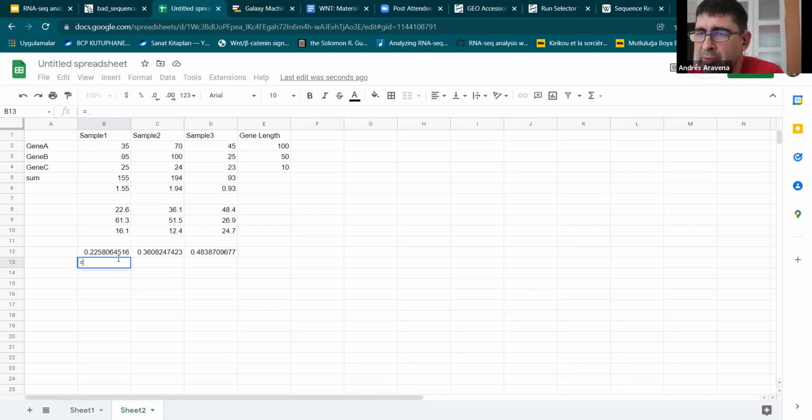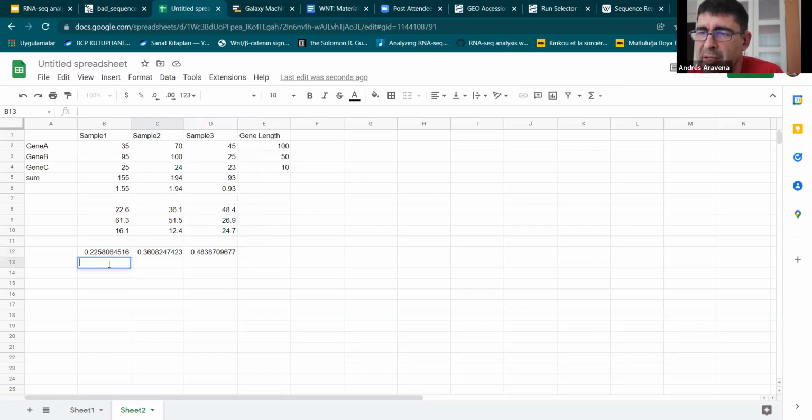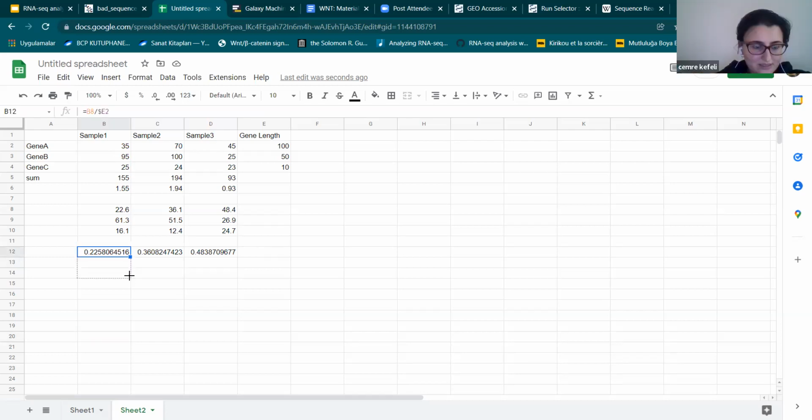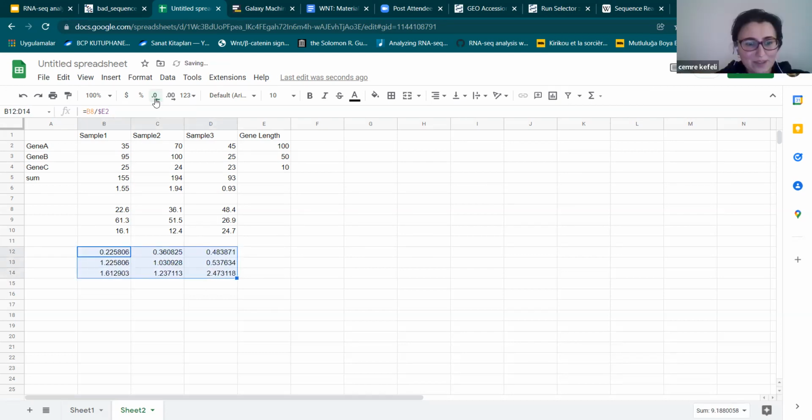I think you can copy. Going like this, you mean? Yeah, but you are editing. You stop editing the cell and then you copy. Like going like this. Yep. E3, yeah. Magic. That is the dollar magic. Dollar sign, okay? It's not the dollar itself. Yeah, let's make this.